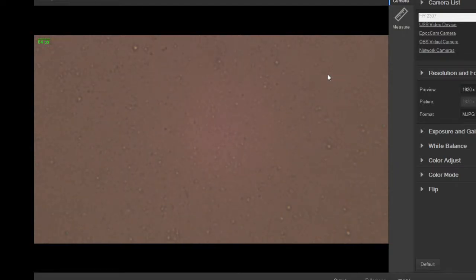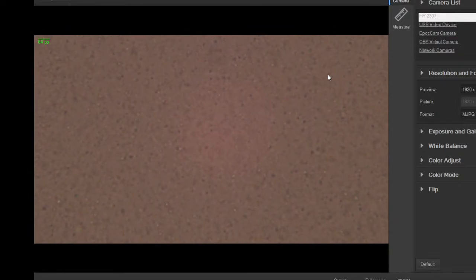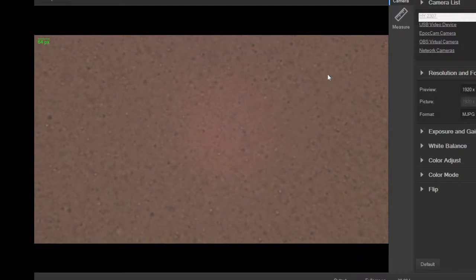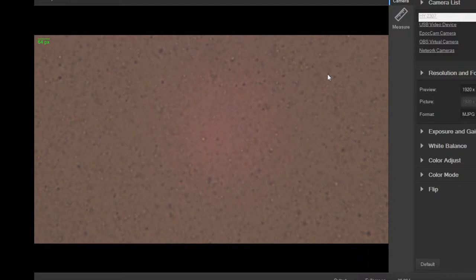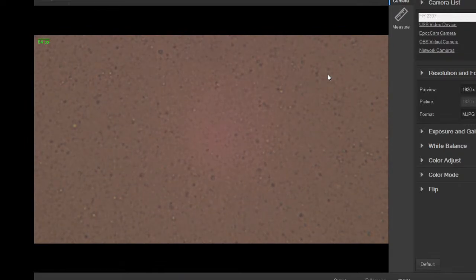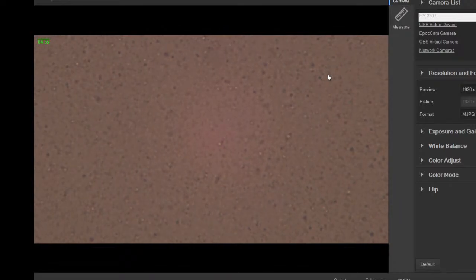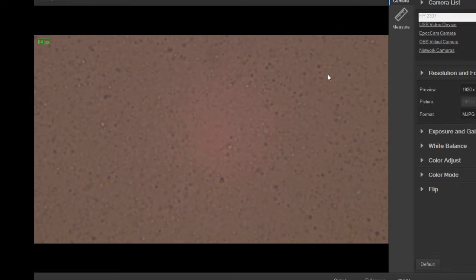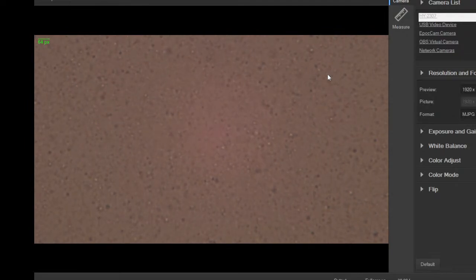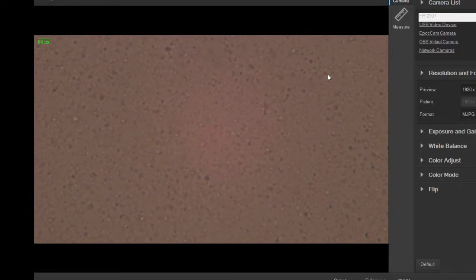So you can see all the milk particles kind of swirling about from temperature gradients and general diffusion, and you can see their different sizes, like fat globules and protein bits and all that stuff. And then there's a bit of randomness, kind of like how bacteria will dance in place from Brownian motion from the heat of the lamp.